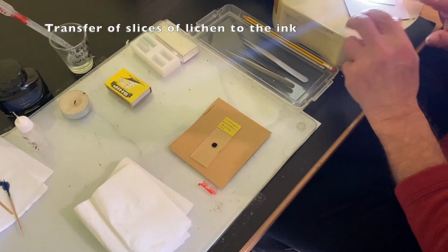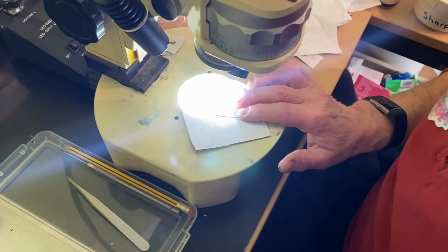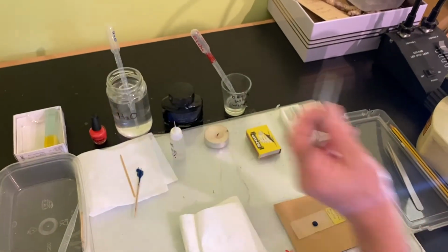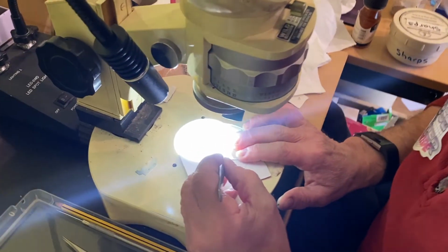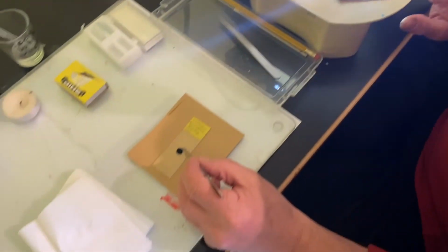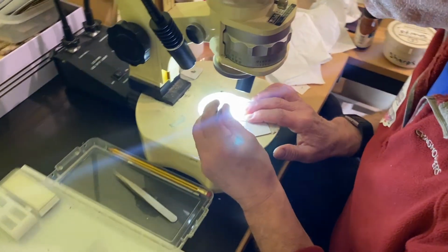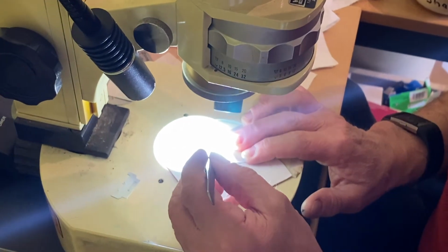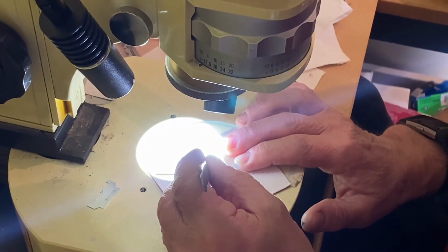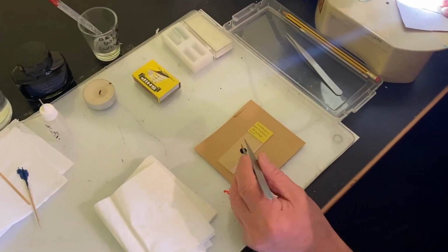Transfer of slices of lichen to the ink. Transfer the previously prepared slices of lichen to the inky drop. Wetting the forceps tip aids picking up the lichen slices. Transfer the material using the ultrafine forceps under direct vision, looking down the dissecting microscope. Transfer as many lichen fragments to the ink as you wish.